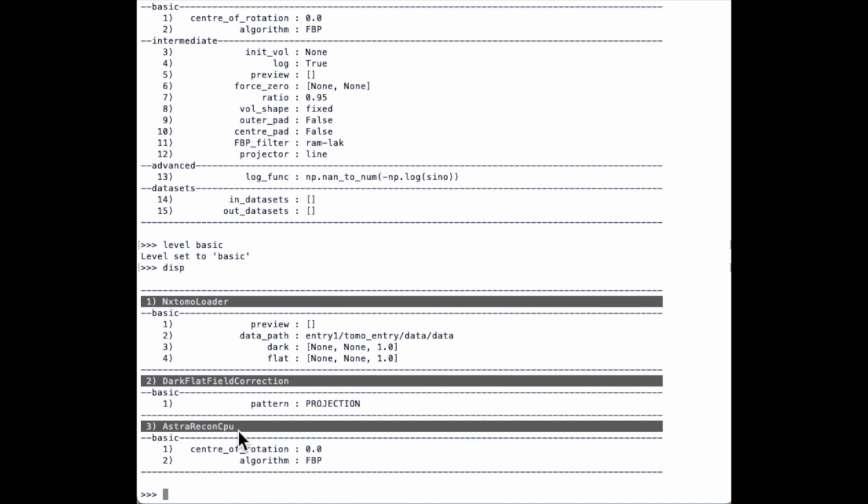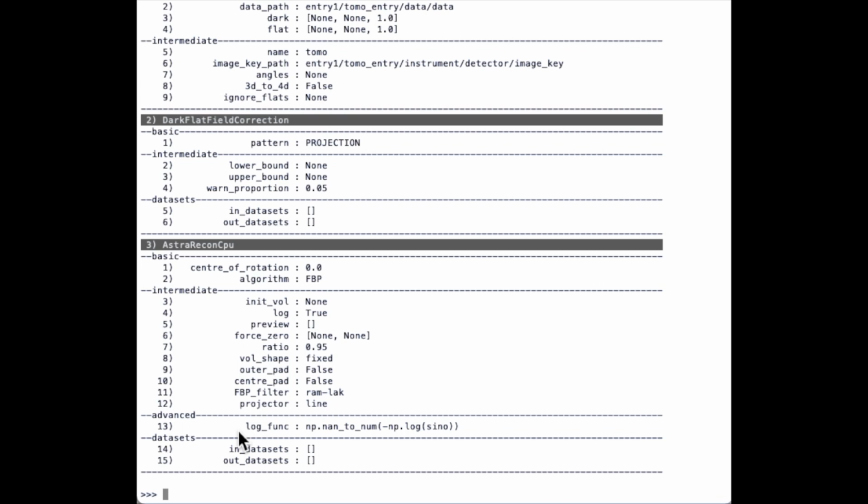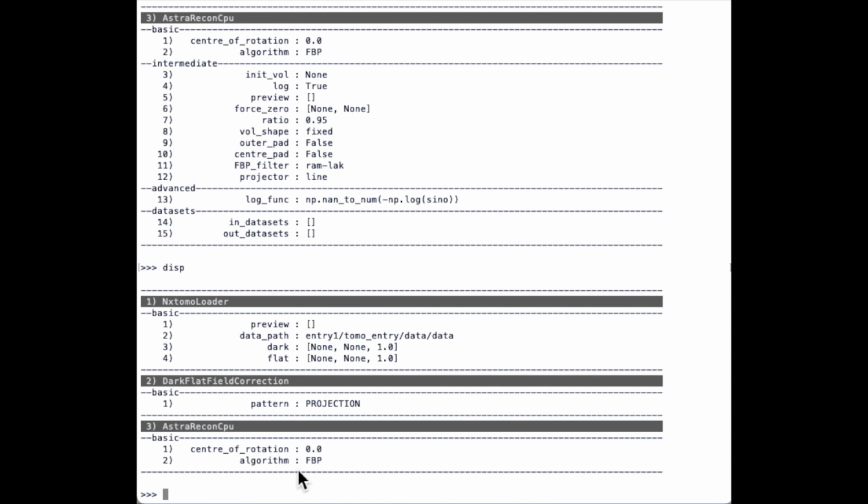these are the default parameters everyone will see, and if you don't want to modify your level command, you can temporarily see all available parameters using disp -a, which will show all of the parameters available without modifying the level every time disp is used.